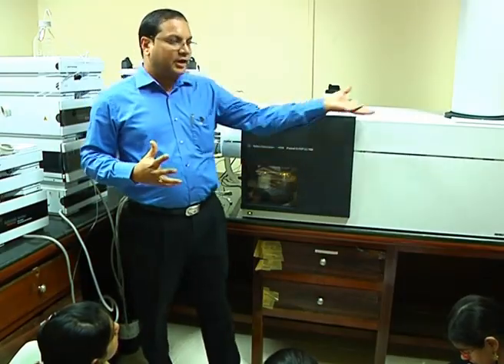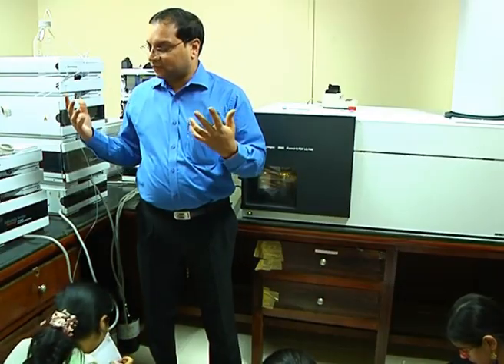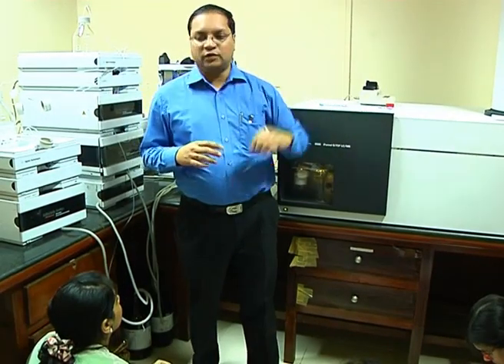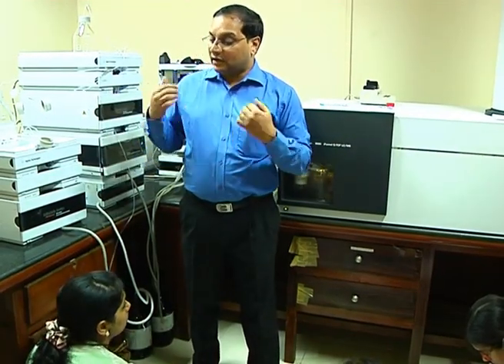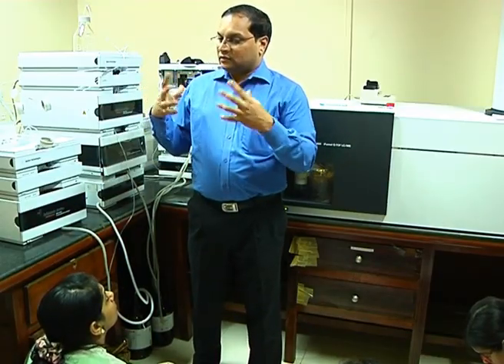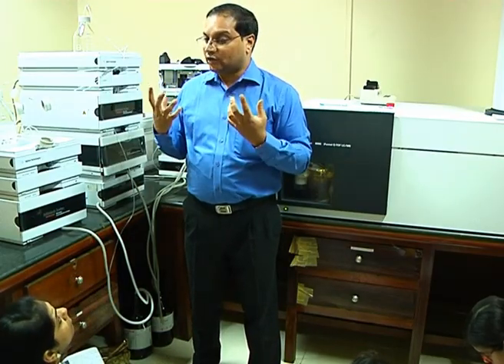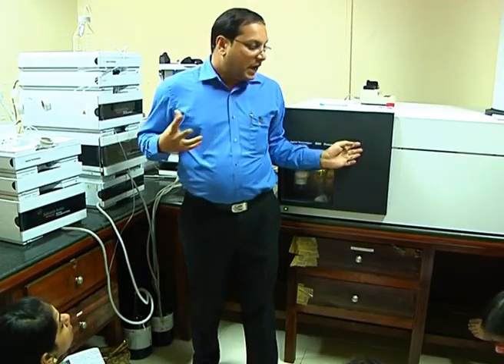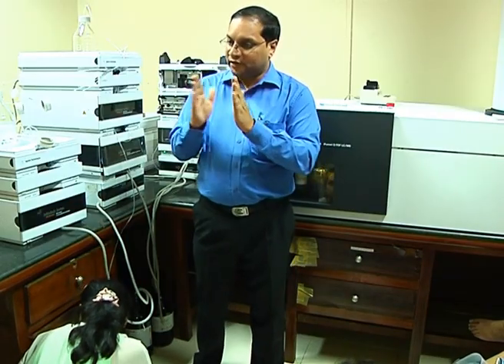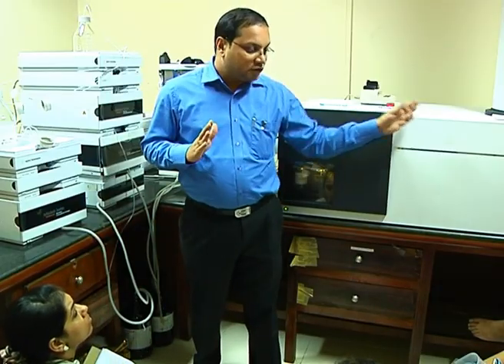In this case, quadrupole and time of flight are talking to each other with MSMS, also called data dependent acquisition, and all those things you might have heard. And we need to have two different analyzers. For our case, in an unknown scenario, we know that there are different types of protein, and I don't know about that protein. So in the first place, I want to establish the identity of that protein. So I need accurate mass information. I cannot use a triple quad type of device, which has unit mass resolution. It cannot see beyond a 1 Dalton difference, so it is not accurate.